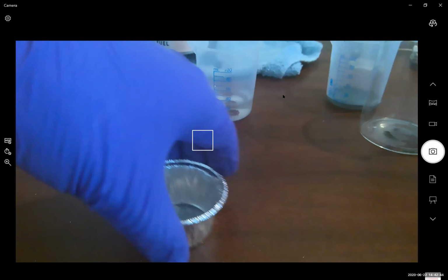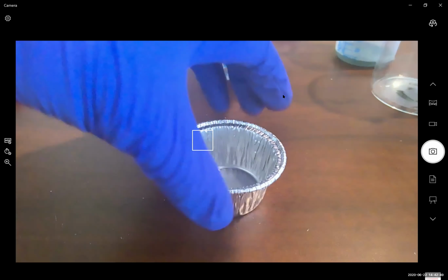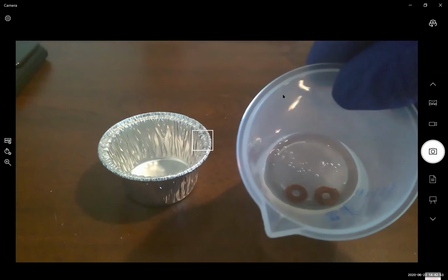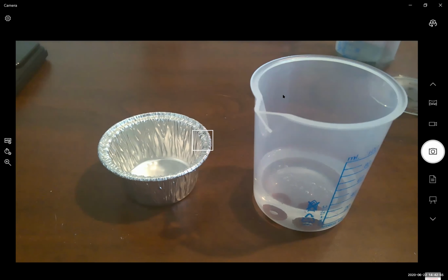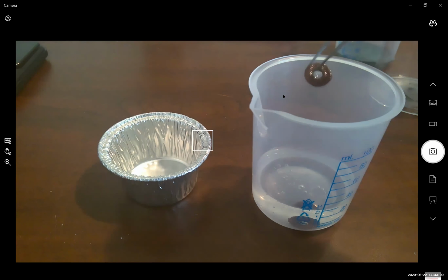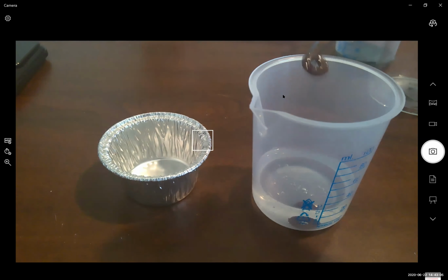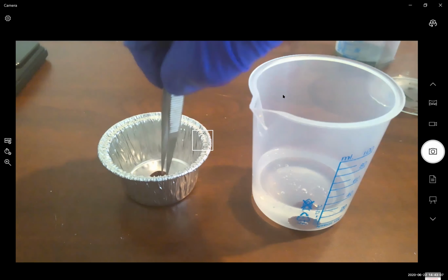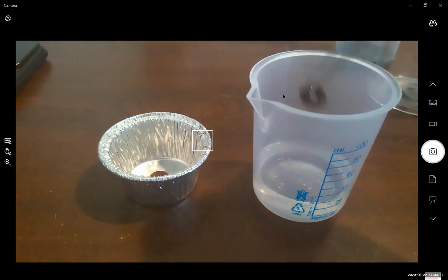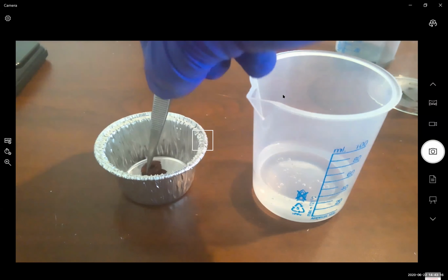So now we have our aluminum cup and we have our aluminum pieces coated in copper. After rinsing our piece in deionized water, we're going to place the piece down into our aluminum cup. Just only one at a time.